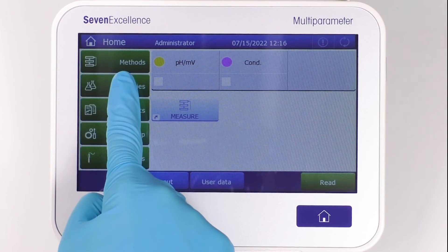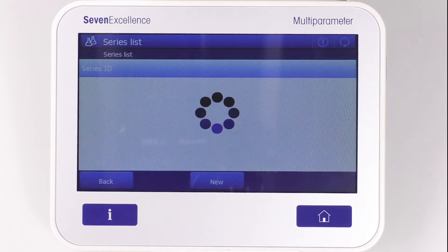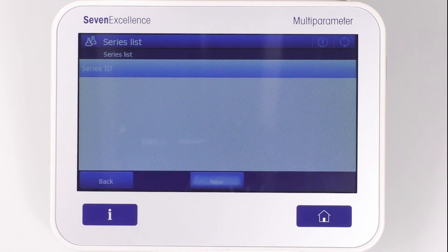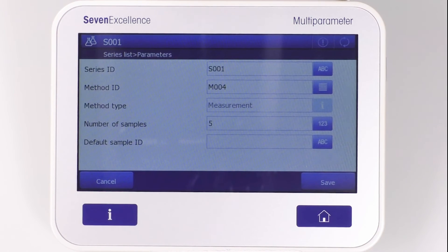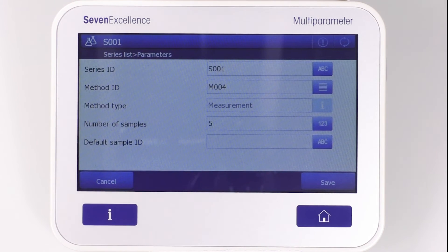To create a series of measurements, you enter the series menu and tap on New. Then the parameters like series ID, method ID, number of samples, and sample ID are selected, and the series can be saved.